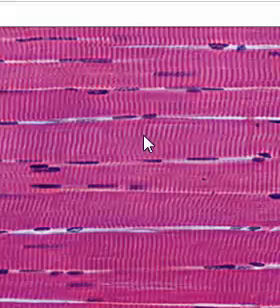So what type of muscle is this? It is skeletal muscle.